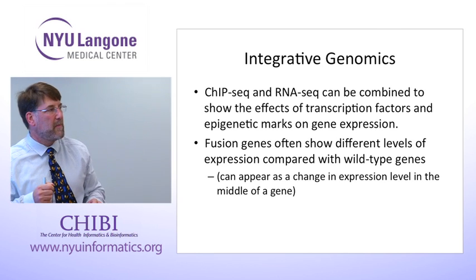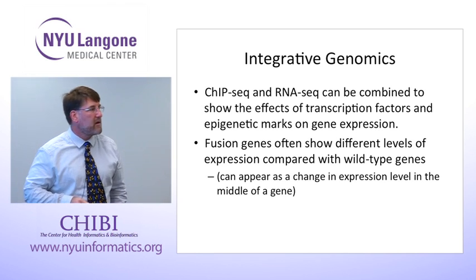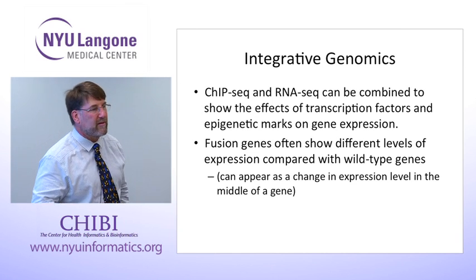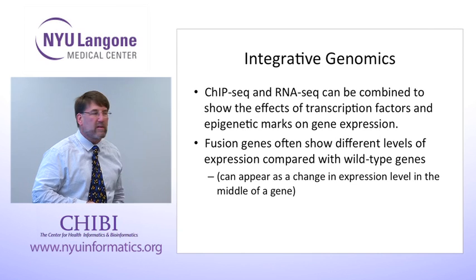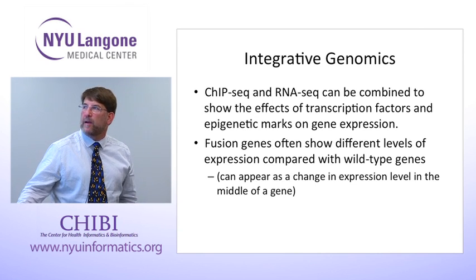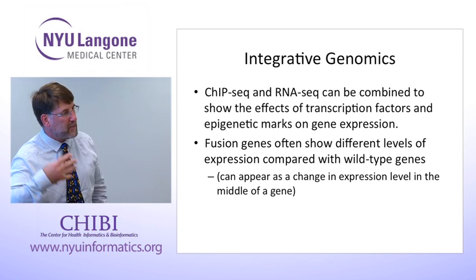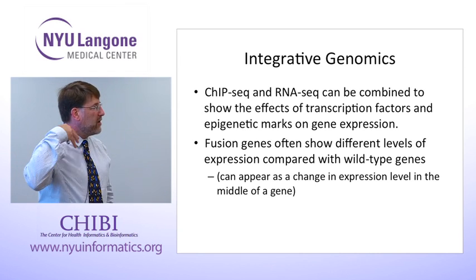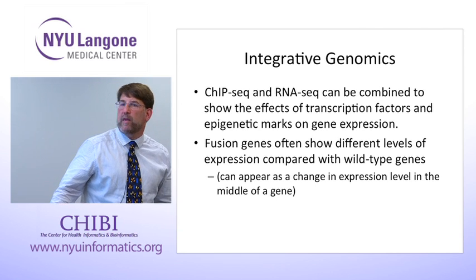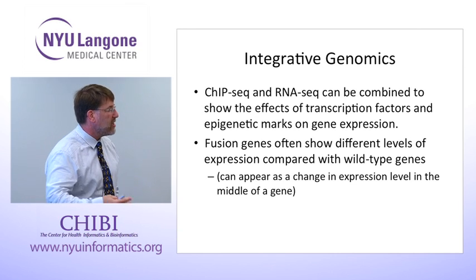Two slides more about integrative projects. You can combine RNA-seq with other methods. We're mostly interested in combining them with other sequencing-based methods, but certainly they could be combined with all kinds of other biology. We did some experiments where we combined RNA-seq and ChIP-seq. We were looking at epigenetic changes that would affect gene expression, and we found some pretty good results. And we can also combine that fusion gene detection with gene expression.